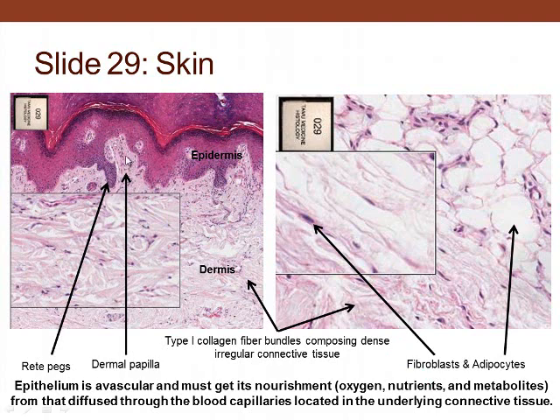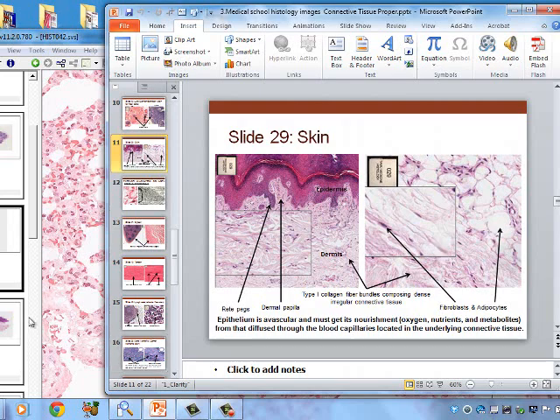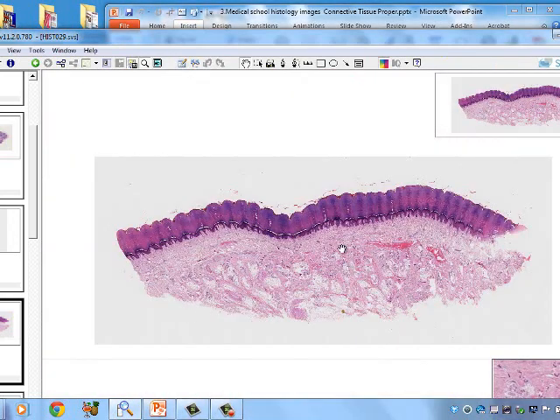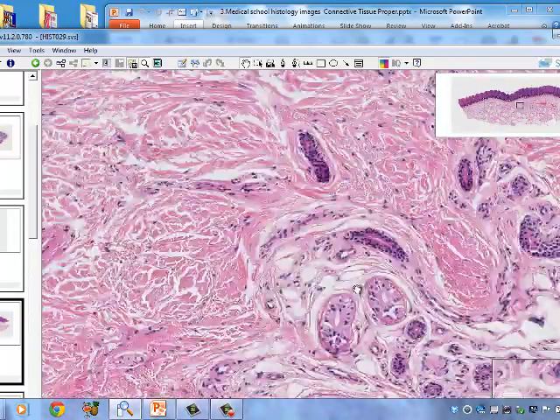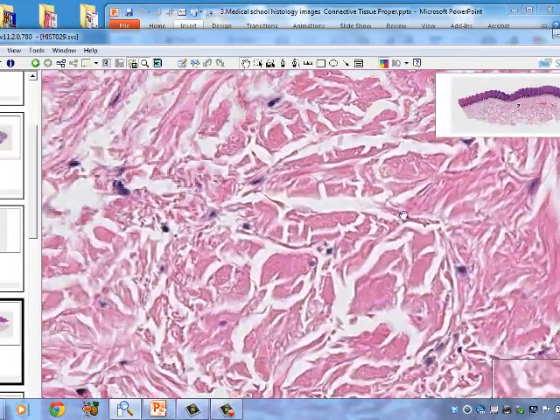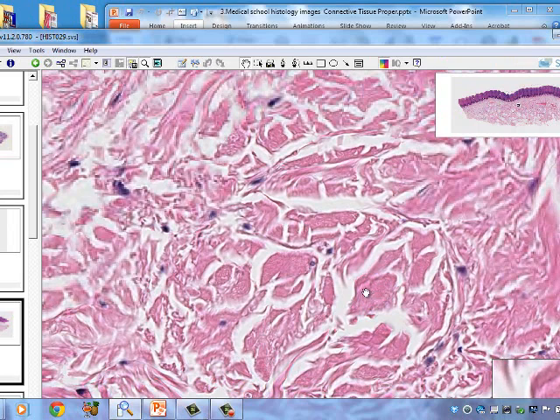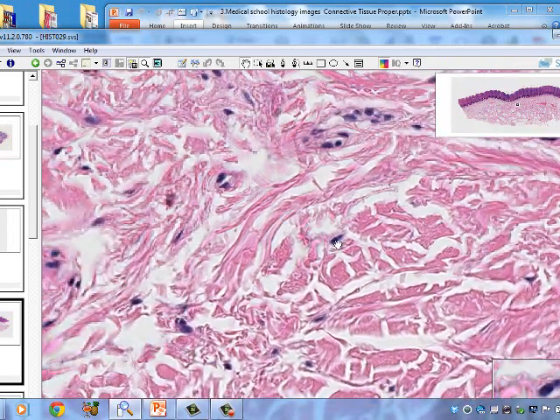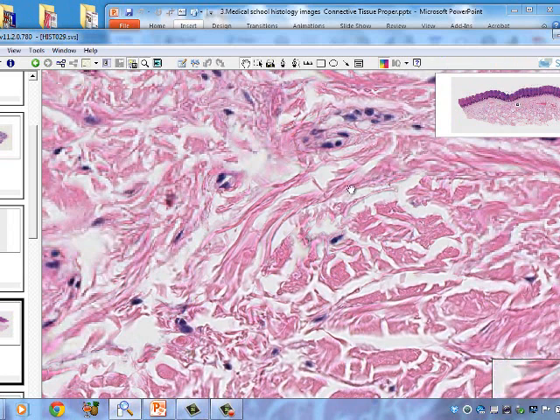These interdigitations increase the surface area between the epidermis and dermis. Looking at the connective tissue in the dermis, we see fibroblasts and fat cells. Large bundles of collagen fibers are visible in the dermis, with occasional cells. Since the fibers are arranged irregularly, this is dense irregular connective tissue.